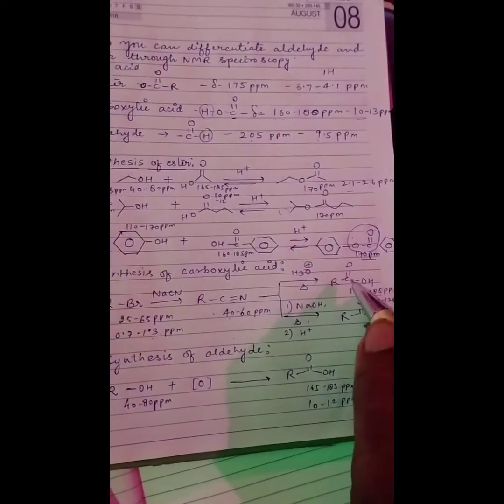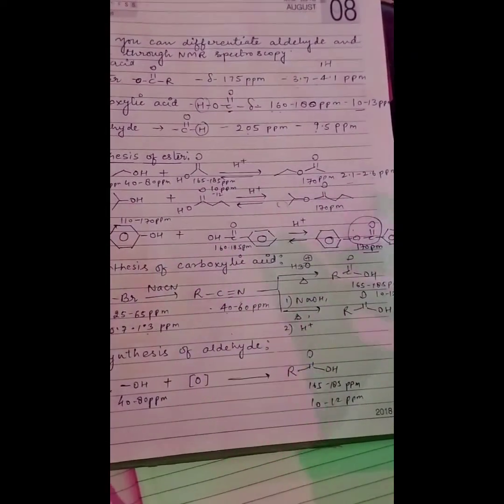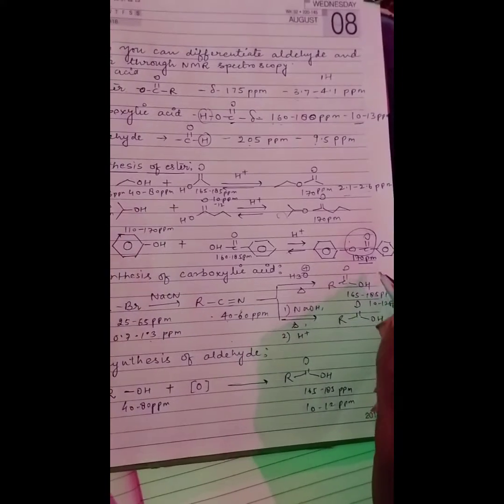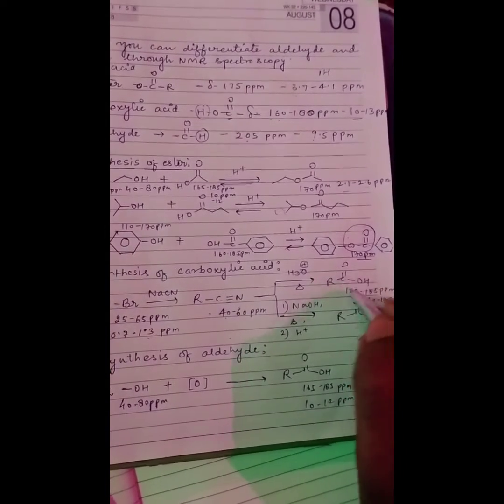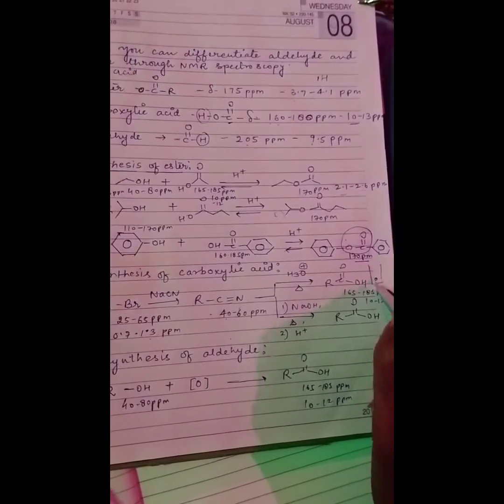The new peak will appear when the acid is formed in your round bottom flask, because the reaction occurs in the round bottom flask. When you check by TLC, a new spot will appear, and it will be the acid. Acid is very polar, and on TLC it appears in the bottom region.